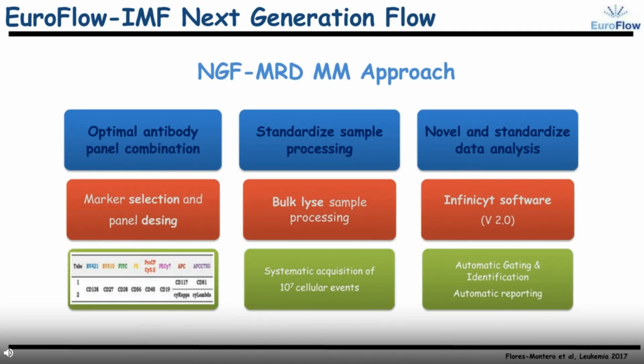You probably all know NGF and the most evident aspect of the methodology, that is, the combination of cellular targets investigated to detect clonal plasma cell populations and the sample preparation protocol which guarantees a sufficient amount of cells to sustain the high sensitivity claim. But I just wish to highlight now the third strong point of this methodology, which could be the one of additional advantage over the molecular method.